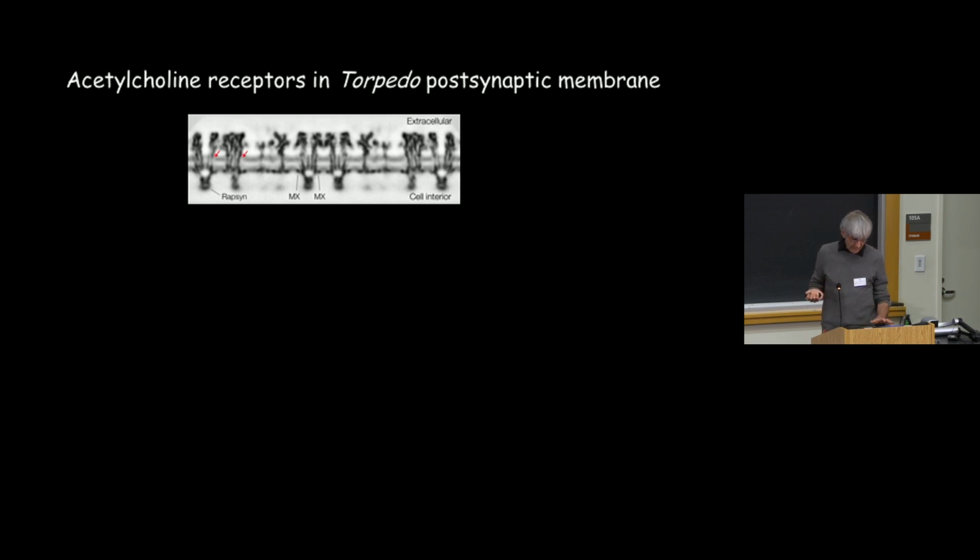One interesting thing about the membrane, when you look at it with the protein masked out, is that it's asymmetric in the density distribution. The density trough in the middle of the membrane is, well, not exactly in the middle of the membrane. This bottom peak representing the intracellular phospholipid head groups is about 3 angstroms further away from the low density trough than it is there. And what that means, from people's studies of mixtures of cholesterol and phospholipids, is that the cholesterol has ordered the fatty acid tails of the phospholipids, making them straighter so they extend a bit. That's how the change in thickness arises.